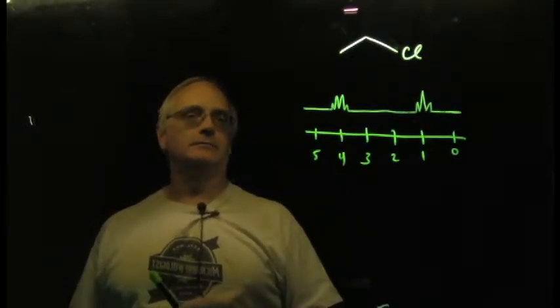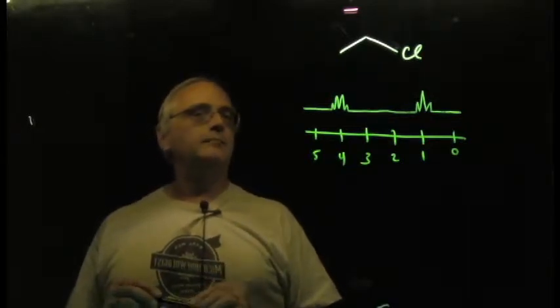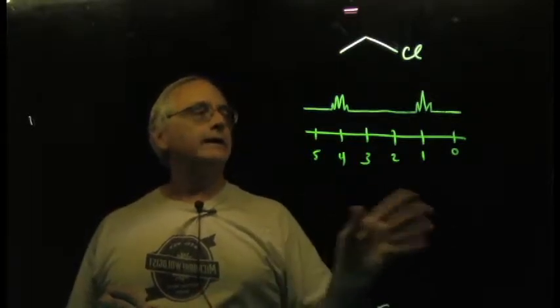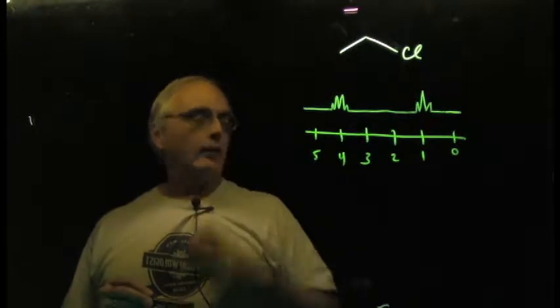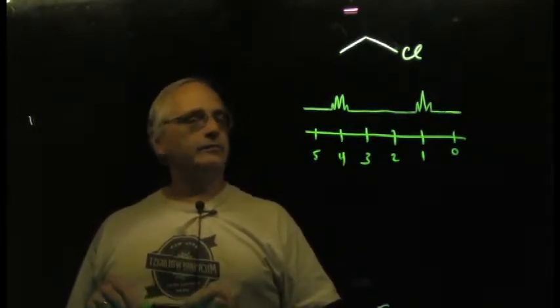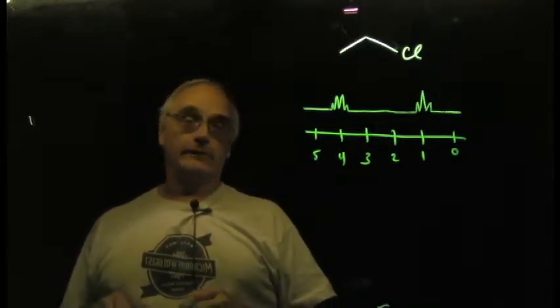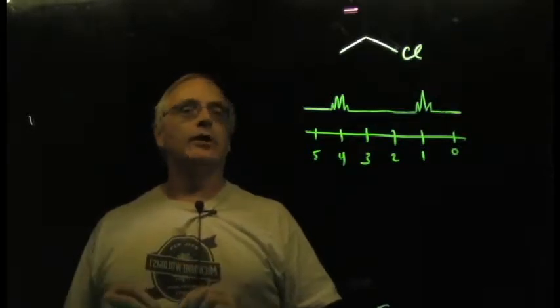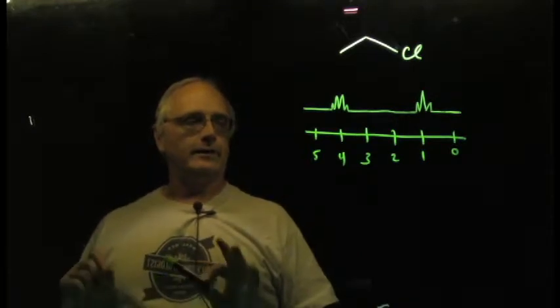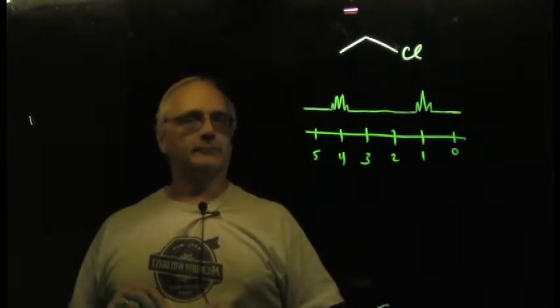So we take this simple little molecule and define, for just a second, what we mean by integration. And that is simply counting the number of hydrogens in each of these signals. Now, integration is a property of only proton spectra. We don't do that in carbon-13 NMR spectra typically. And there are very good reasons for it, and yes, we'll talk about that too. But for right now, integrated spectra is almost exclusively referring, for our purposes, to proton NMR spectra.